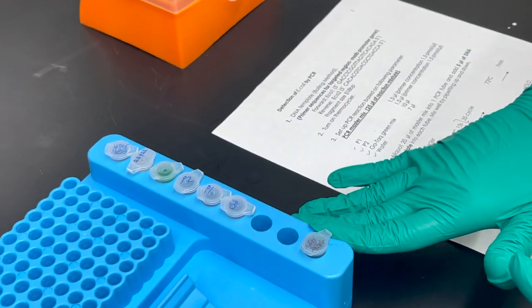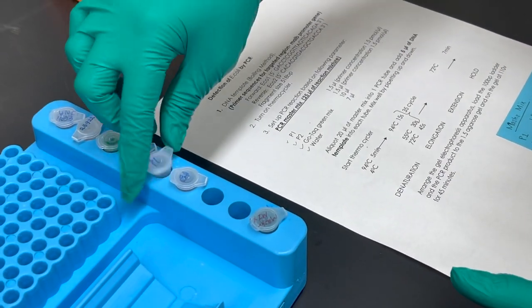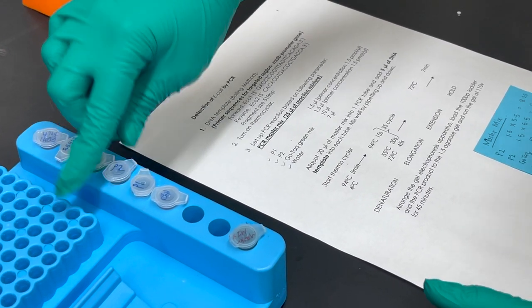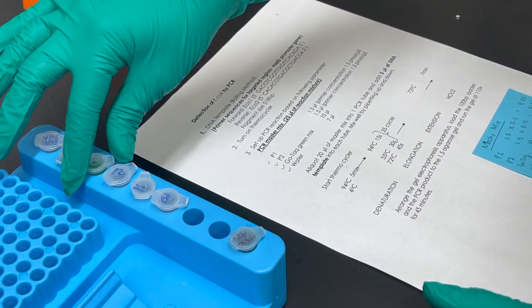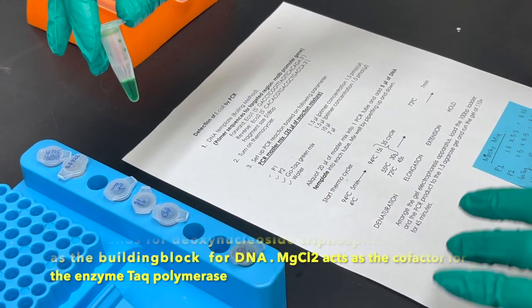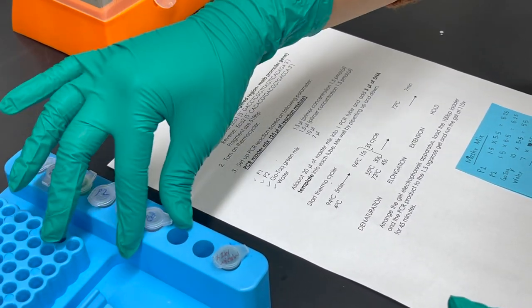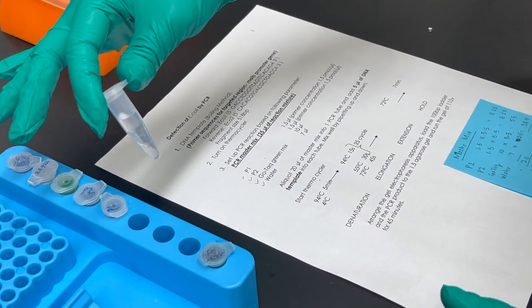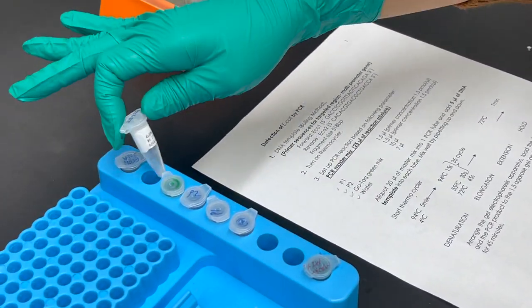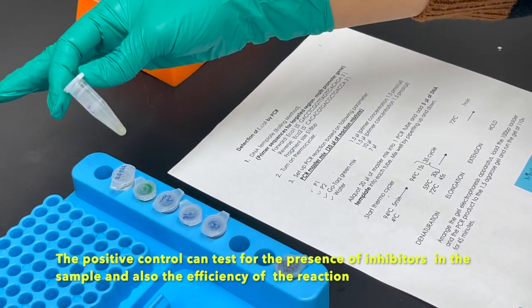These are all the reagents we need for PCR. We have the primers P1 and P2, which are the forward and the reverse primers for detecting E. coli DNA. We have the GOTAC green mixture, which contains all the dNTPs, MgCl2, and other required reagents. We also have water, a positive control, and the E. coli DNA.